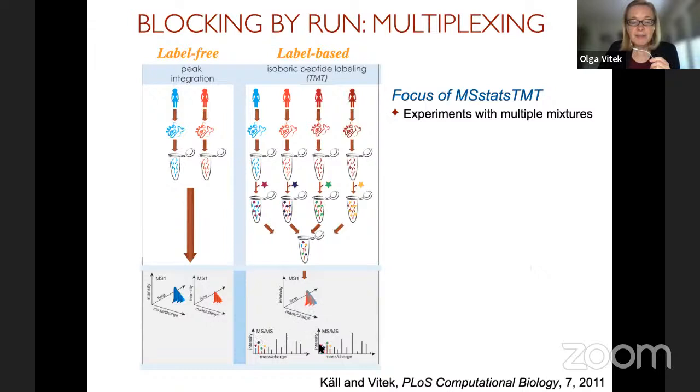On the other hand, if the MS/MS spectrum was sampled closer to the tail of the peak, then these intensities will be lower, simultaneously as a group, right? Just because there was less biological material during this time. So as a group, these reporter ions tend to vary together, higher or lower. And so statistically, we have to account for these differences, right? Because they represent the technology and not the biology.